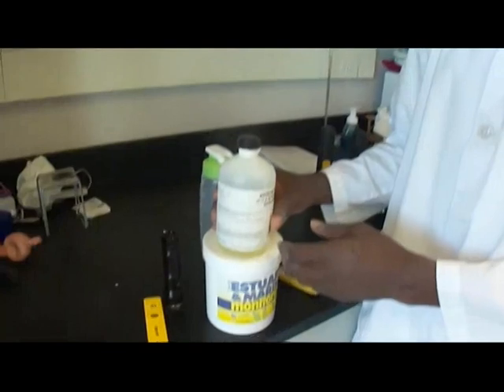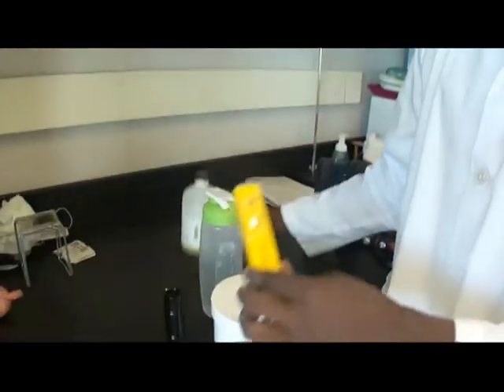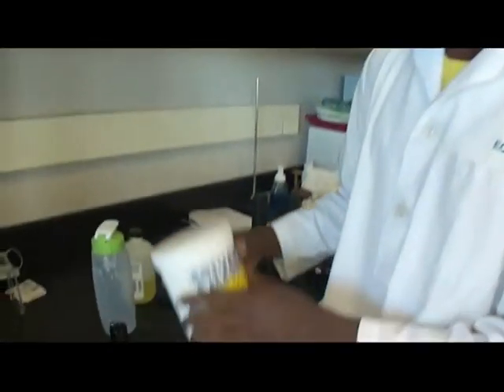Okay, so what we have here, these are some of the materials that we're going to take down to the Gulf with us. We have buffer solution, which is used to calibrate the pH meter. We also have this bottle, which we'll use to collect our samples of the Gulf. We have the estuary and marine monitoring kit to test the water. Now we're on our way to Florida.